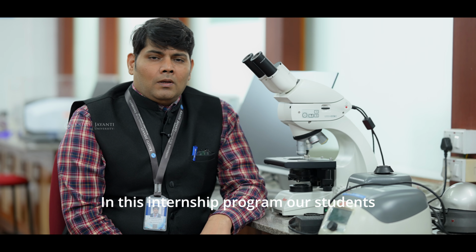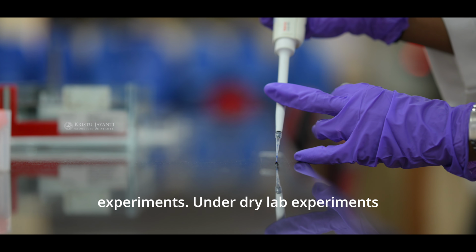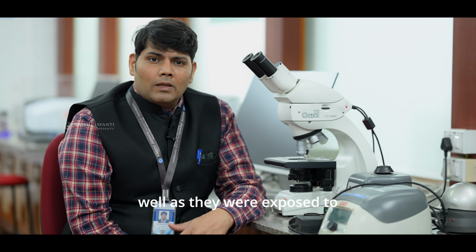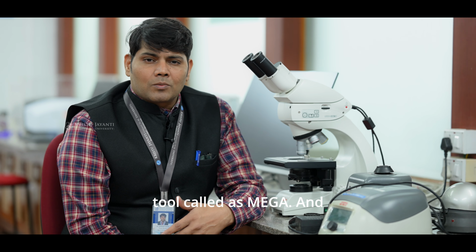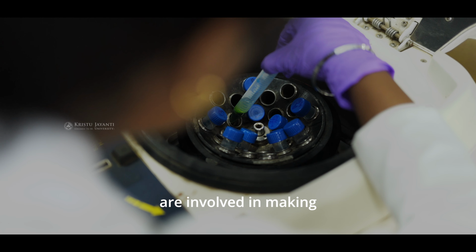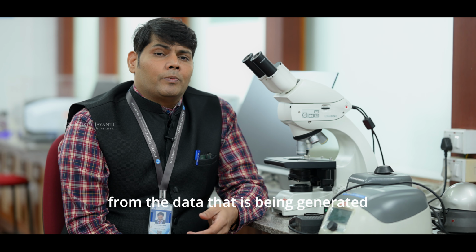In this internship program, our students have been exposed to both wet lab as well as dry lab experiments. Under dry lab experiments, they were exposed to various tools, especially BLAST and Primer3, which is useful for primer designing, as well as a molecular phylogenetic tree construction tool called MEGA. All these tools help them to understand how exactly they are involved in making the phylogenetic tree from the data that is generated using the DNA barcoding information that they have obtained from the samples.